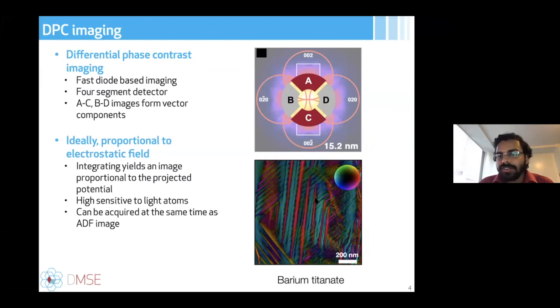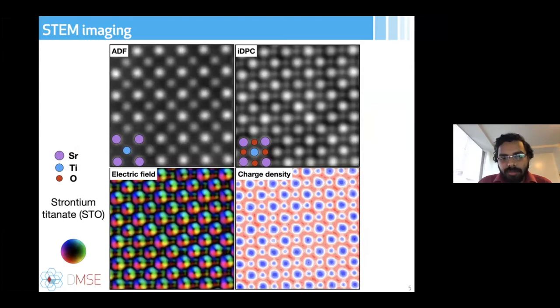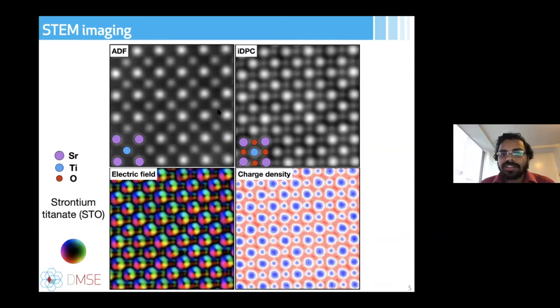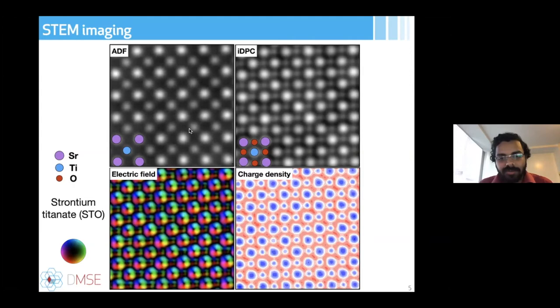Here is an example of barium titanate, where we can see at nanoscale the different domain structures. These detectors are sensitive to changes in polarity or the electric field inside materials. At the atomic scale, combining DPC with ADF imaging is very powerful: ADF gives Z-contrast but lacks oxygen contrast, while integrated DPC (IDPC) provides oxygen positions. We can use these detectors simultaneously to get information about both light and heavy elements.